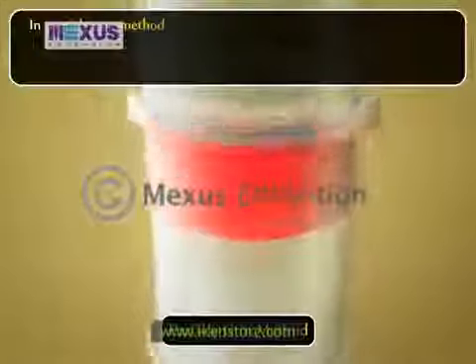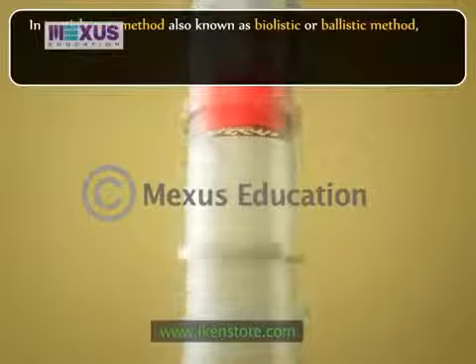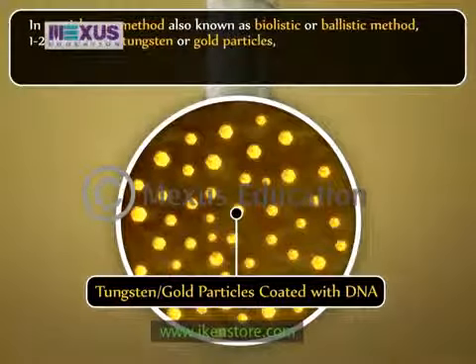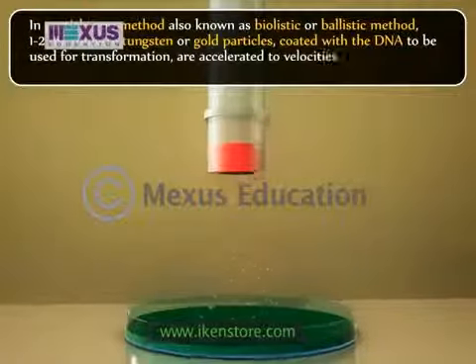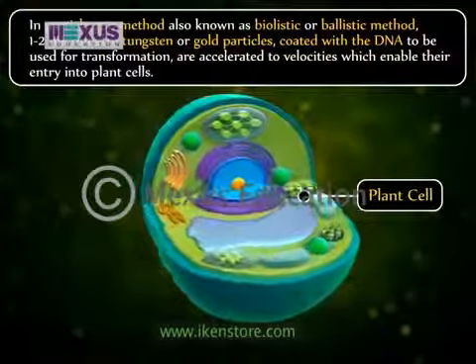The third method is the particle gun method, also known as the biolistic or ballistic method of DNA. In this method, 1 to 2 micrometer tungsten or gold particles coated with the DNA to be used for transformation are accelerated to velocities which enable their entry into plant cells.